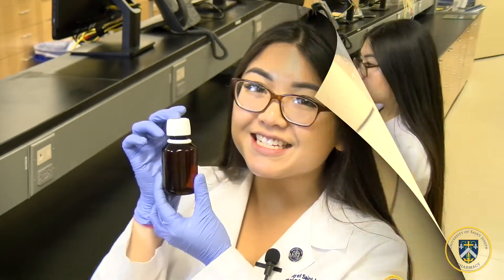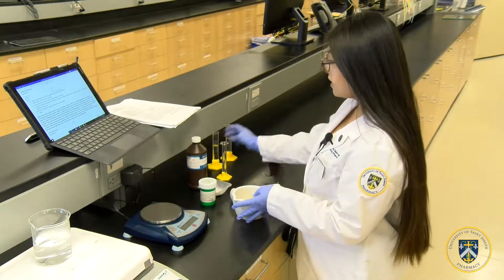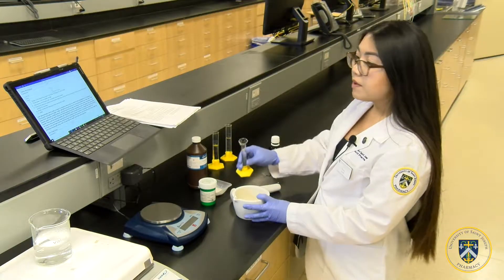I will demonstrate how to make castor oil emulsion, which is used as a laxative and has a beyond-use date of 14 days. I'll demonstrate how to do a wet gum emulsion, where water will be the base.